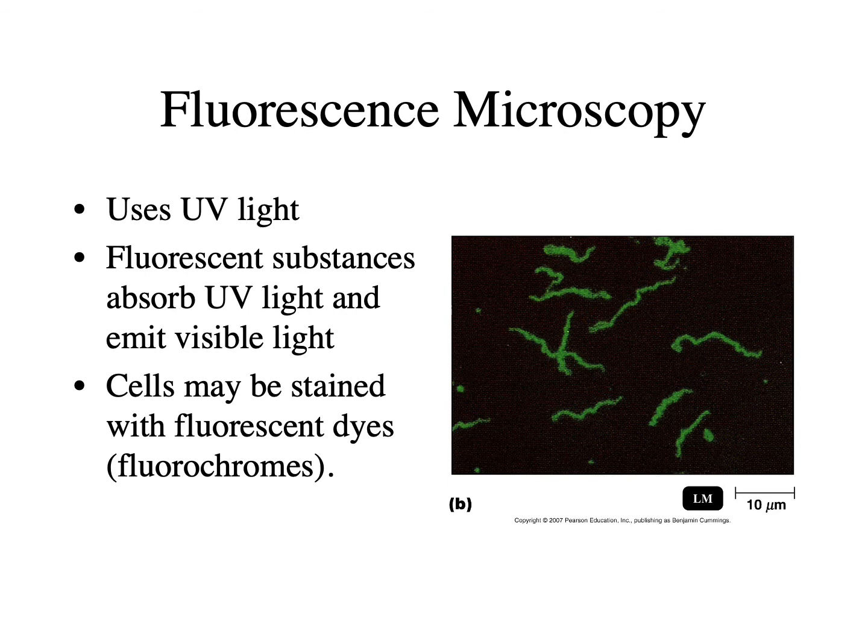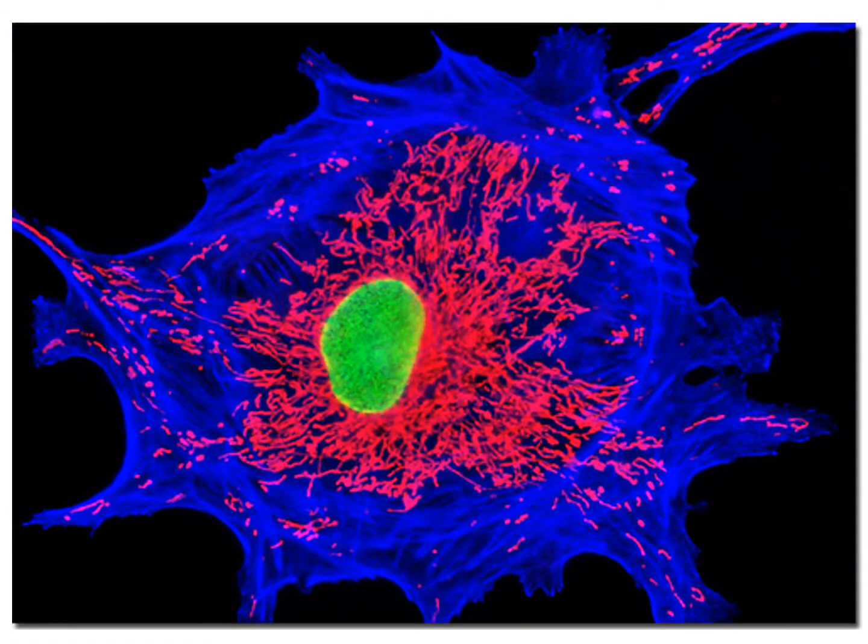Fluorescence microscopy uses a special dye to basically glow in the dark against a dark field. So these are really cool. They're really bright. It is dark field, but because it glows, you see things really, really super easily. You should know that a lot of fluorescence is very specific to certain types of cell structures.